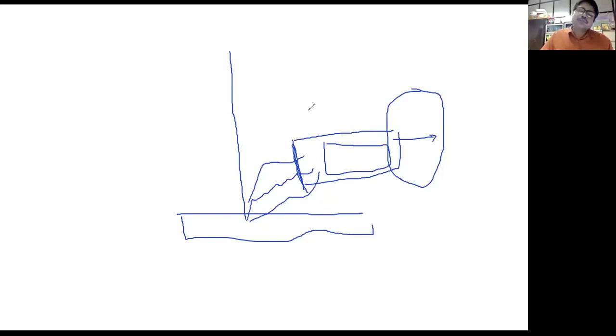So that means the thumb rule is that you cannot confidently have a correct interpretation of atomic percentage of oxygen. Don't do that. You can start with fluorine onwards. So mostly people show oxygen percentage. Please do not do that, because of this window absorption.